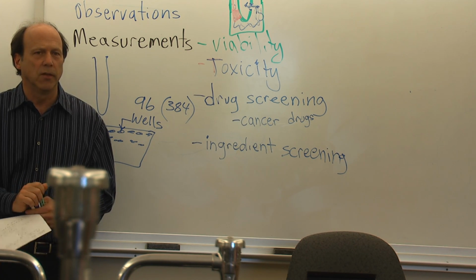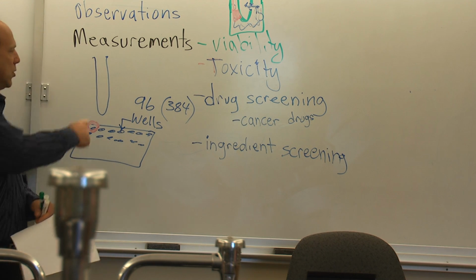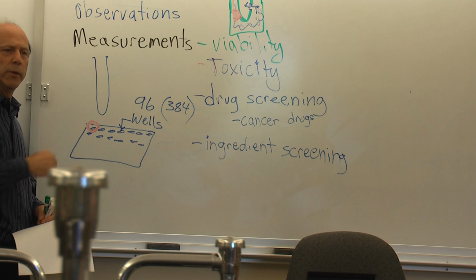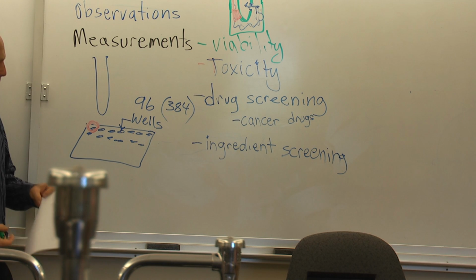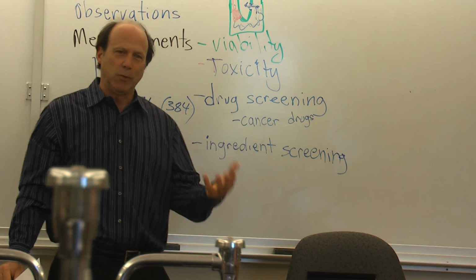Those are tools that allow you to do much more. Basically, you're doing almost 100 times more than you were doing with the one test tube by using multi-well plates. So that's kind of cool. And then these plates have machines that they're coupled with.